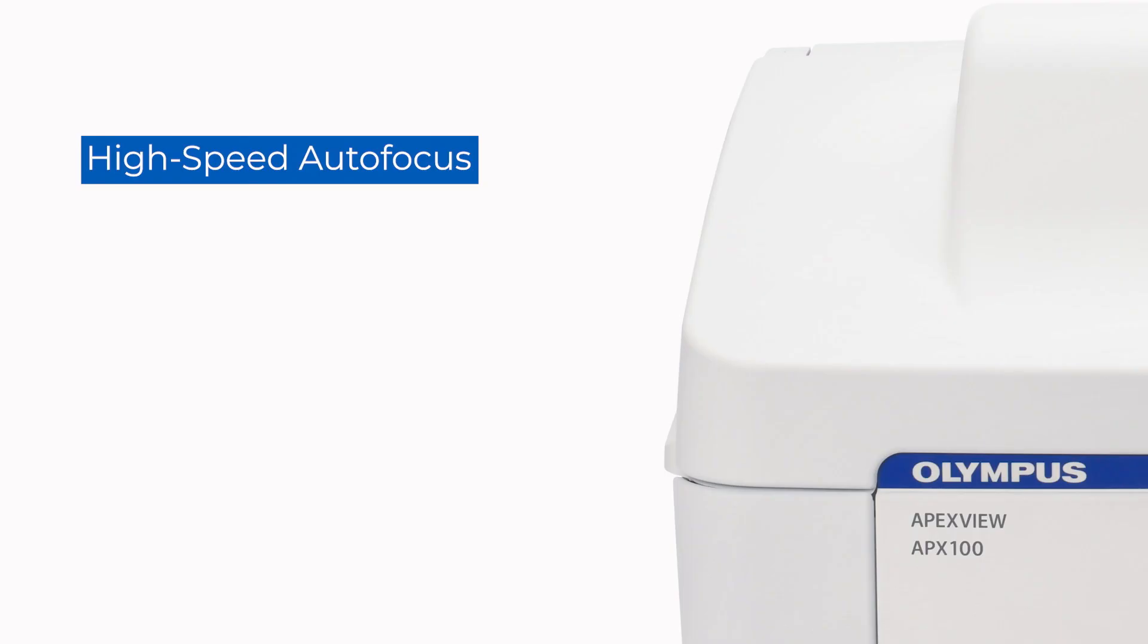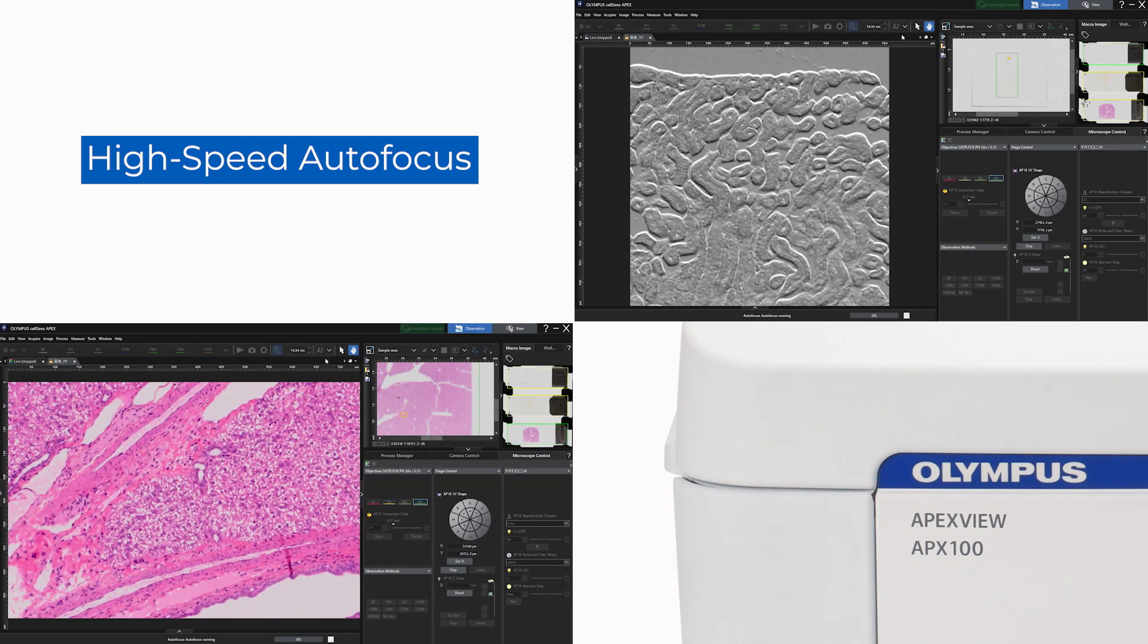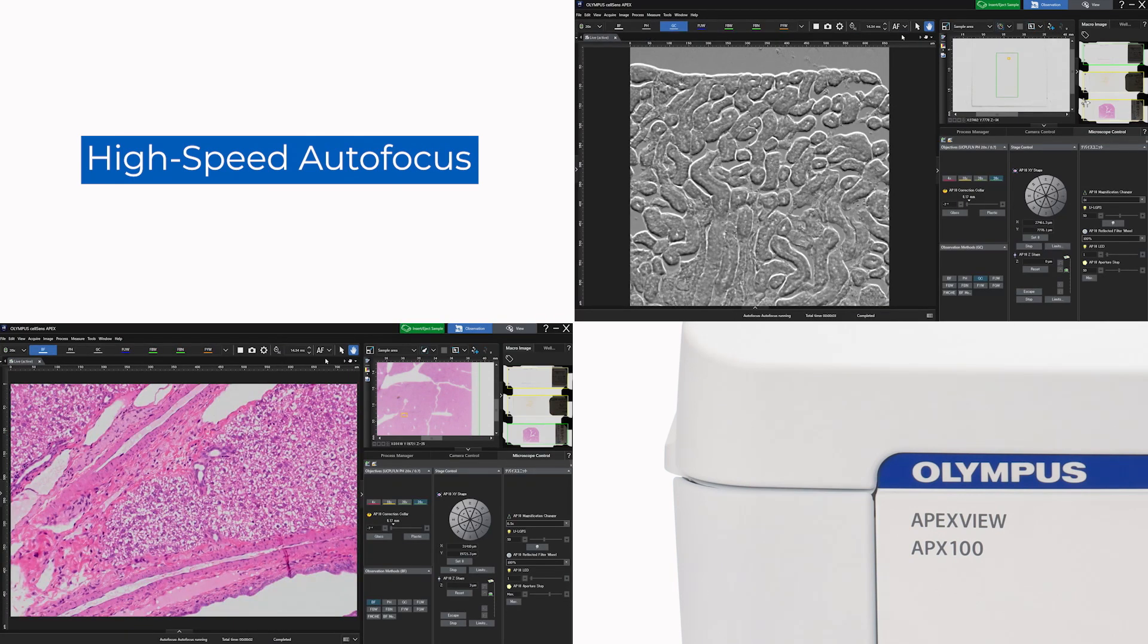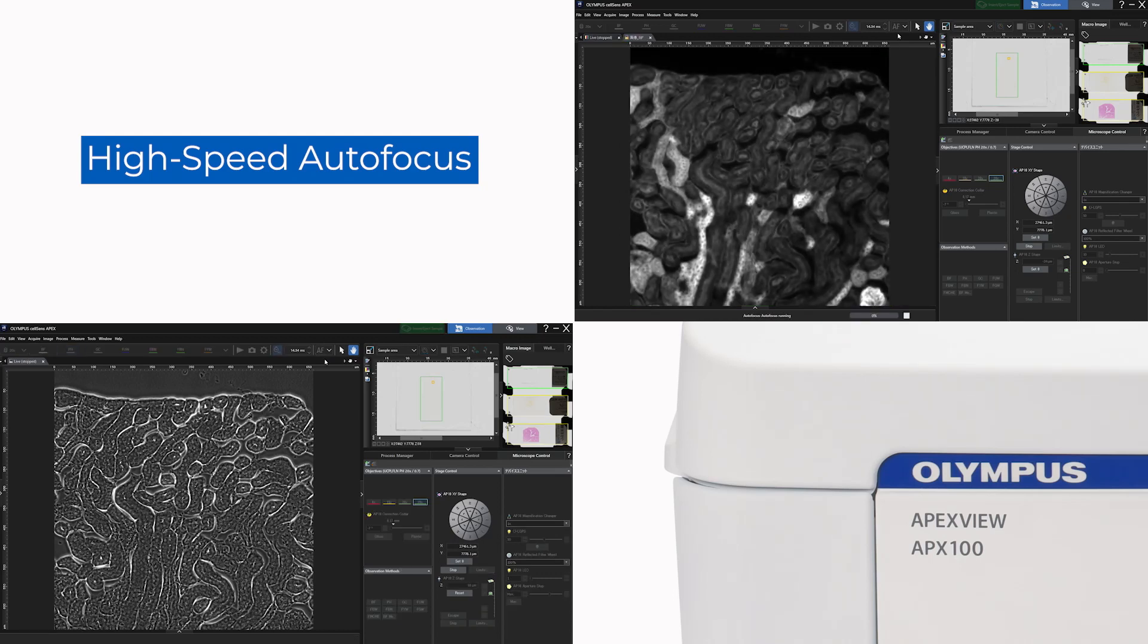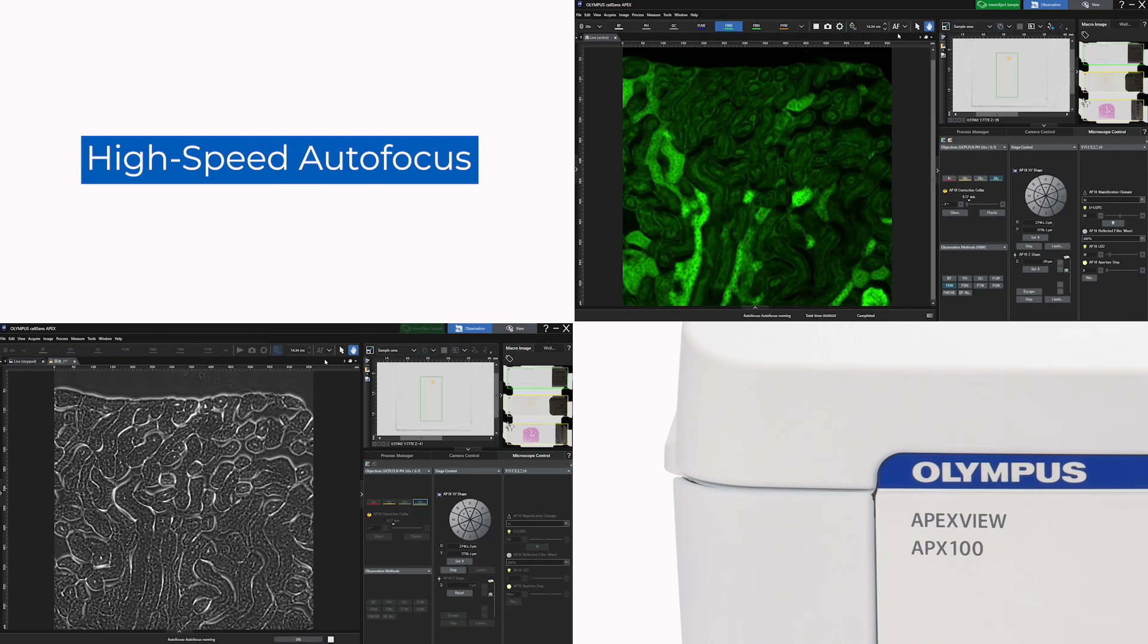The system's high-speed autofocus enables faster focusing, reducing the time and stress of making focus adjustments during each step of your experiment.